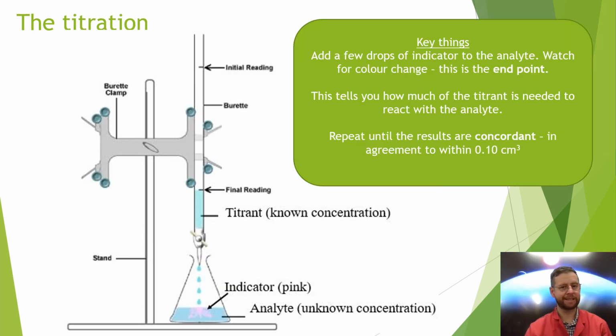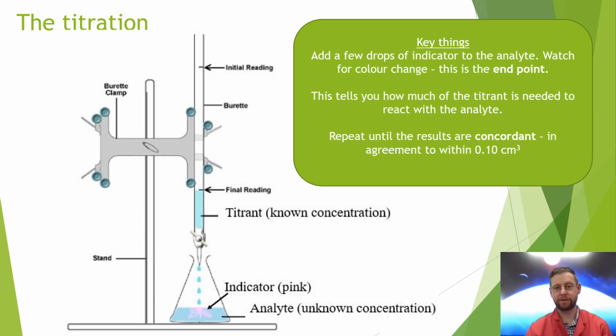And so here it is. We use a special burette clamp to hold our burette in place. We make sure that the stopcock is turned horizontally, and then we add the titrant to the top, making sure that the volume falls somewhere between the smallest and highest reading on the burette. It's a mistake to believe the burette must start at its 0 point. It has to just be somewhere between these two.